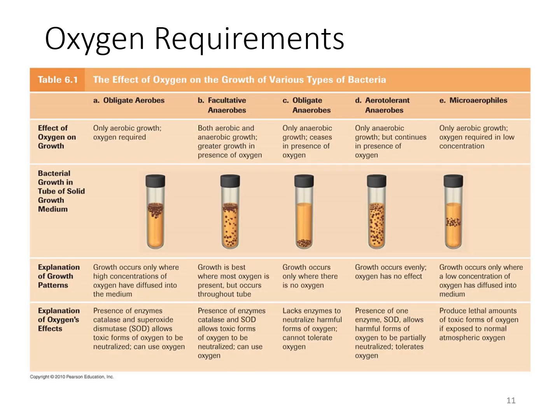So here we have a chart describing the oxygen requirements of the various organisms. With this, you can see a test tube with the agar media inside that tube.